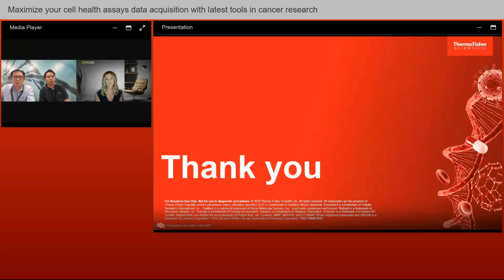So in the scanning software, we have a library that is loaded with different pre-programmed protocols that are commonly used, such as the MTT assay, PrestoBlue, DNA quantification, protein quantification, and more. We can also customize the protocol because we have multiple functions in the software, which allow the user to select and drag and drop onto the protocol, depending on their experiment design.